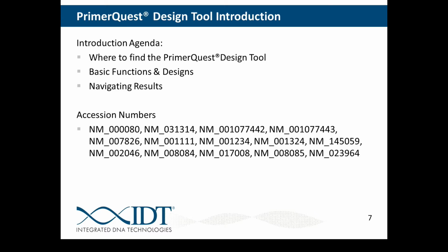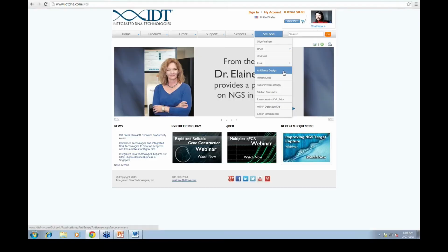For the examples that I'll be doing live, these are the accession numbers that I'll be using, in case you're wondering. I'm going to paste them from a different screen, but just so you know, those are the ones that I'm going to be using.